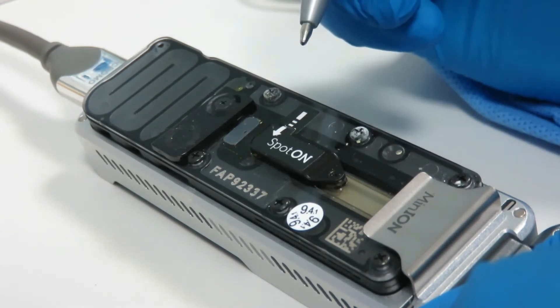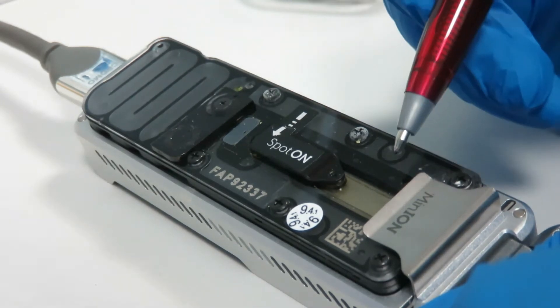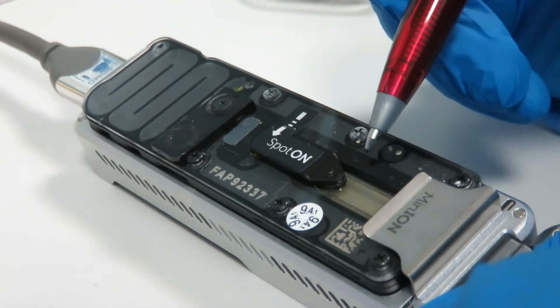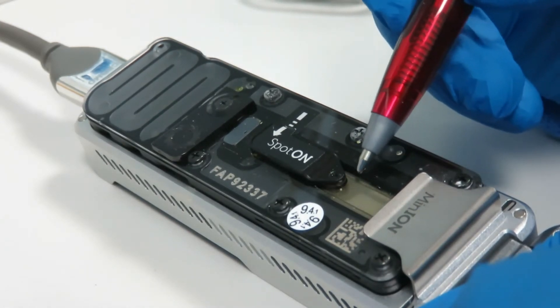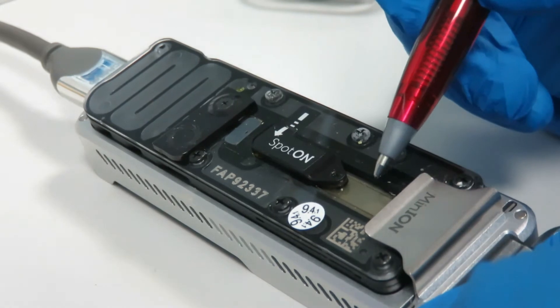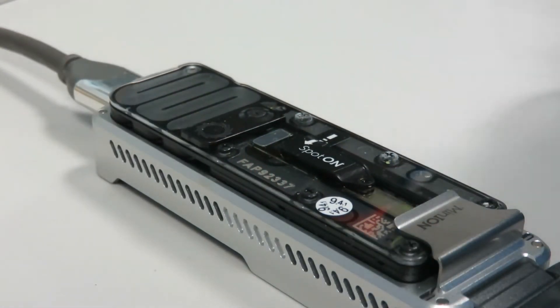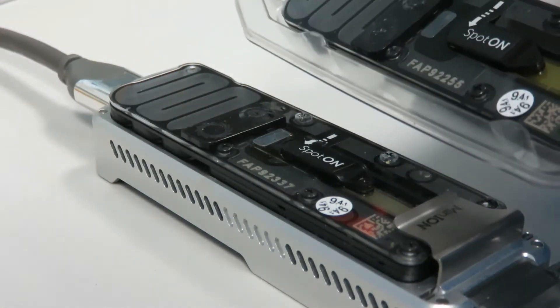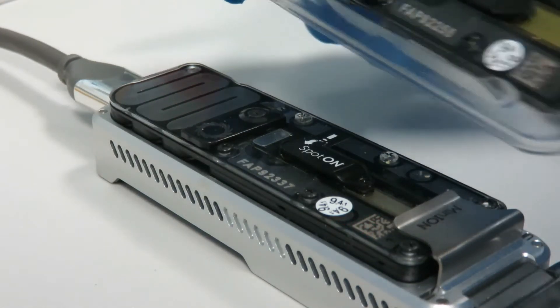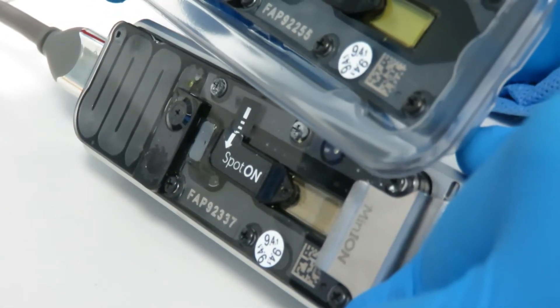On yours and also on mine — because these are used ones — the panel will have a clear liquid and it probably also has some beads in it from a previous loading run. But if you have a new one, you'll see that it's much more yellow, and that's the storage buffer that it comes in.